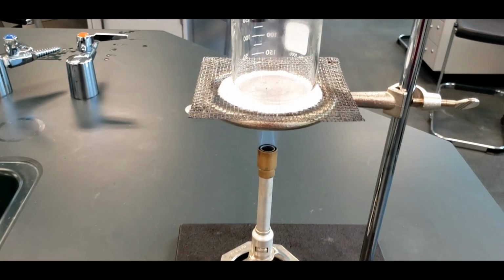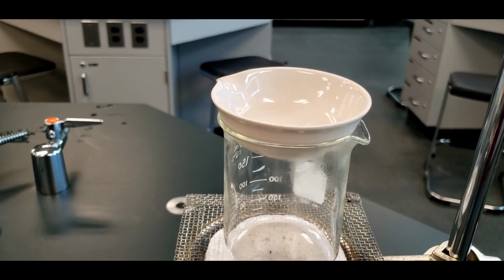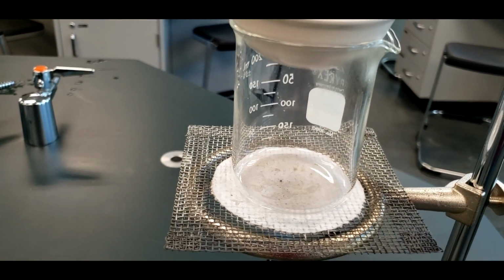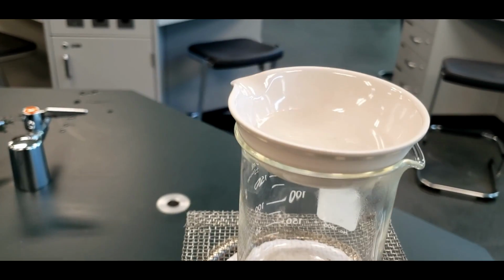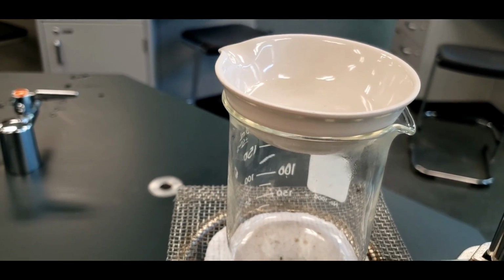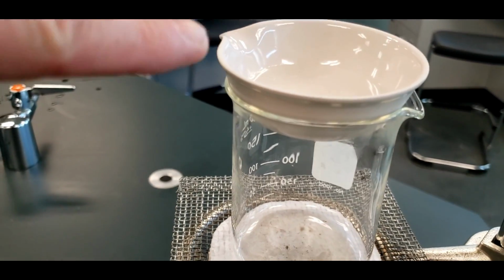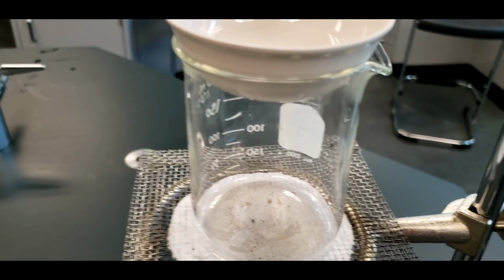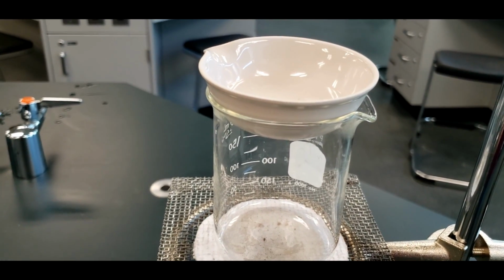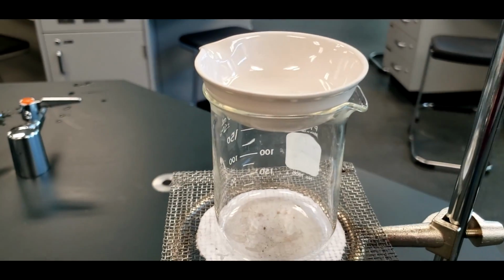So we're heating up a beaker that's empty, and then on top is the evaporating dish with salt solution in there, and we're using the beaker to keep the heating under control until about 3/4 of that solution is gone. Once it drops down to about 1/4 of its volume, we're going to move this down. We'll get rid of the beaker and we'll just put it here and heat it. That'll hurry things along. So this first part will be a little bit slow, but it's steady. Won't have a big sputtering of the solution out. We don't want to lose any sample.